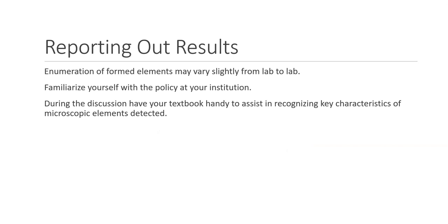If you go from place to place, job to job, this will drive you nuts because every laboratory may have a little bit different way of enumeration of the formed elements. So you need to familiarize yourself with the policy at your institution. During the discussion, have your textbook handy to assist in recognizing key characteristics of microscopic elements detected.